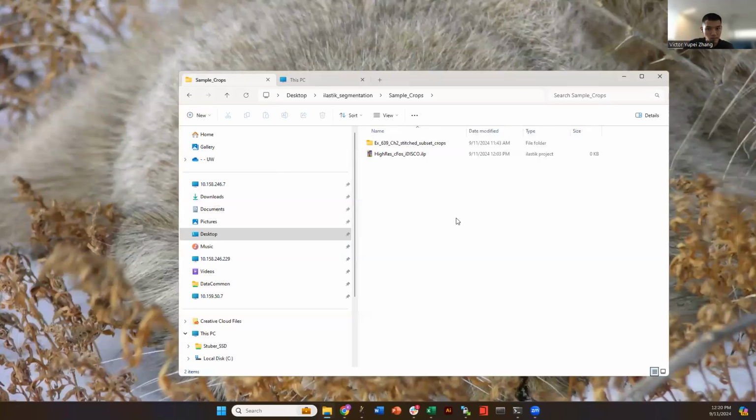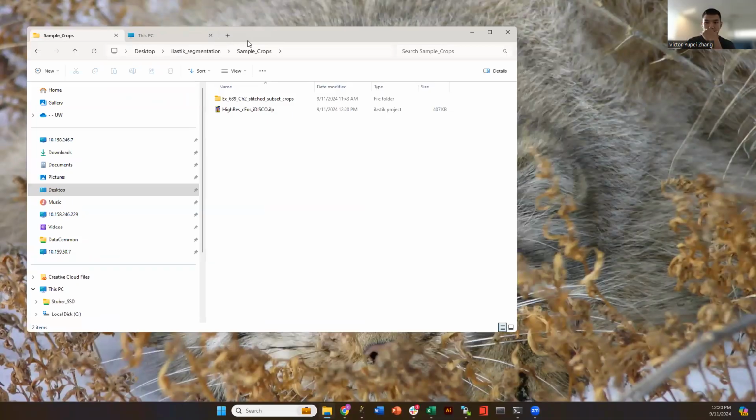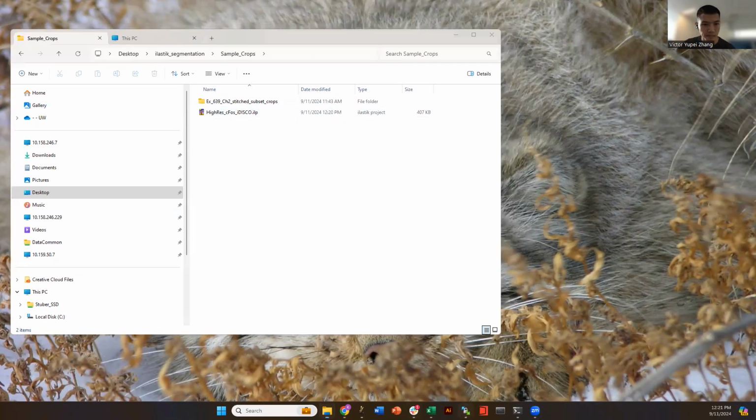And then you can actually close it. So now this classifier is just 407 kilobytes or something like that. Live update before I save, is what you're saying, or before I close it? It doesn't have to be on or off, but live update is the only timing where it regenerates the classifier. So if you train a bunch but don't press live update, it will not make the latest classifier, thus it won't be saved. Got it. So now this is generated.